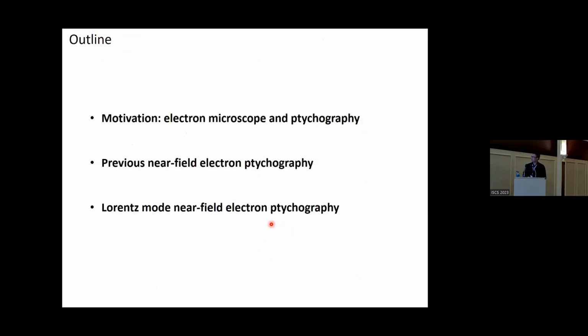I want to start by talking about why we are using electron microscopes. And I want to talk about what ptychography is, but that topic has already been covered by the previous presenters. And then I want to talk about previous near-field electron ptychography. And then I will move on to my work, which is Lorentz mode near-field electron ptychography.